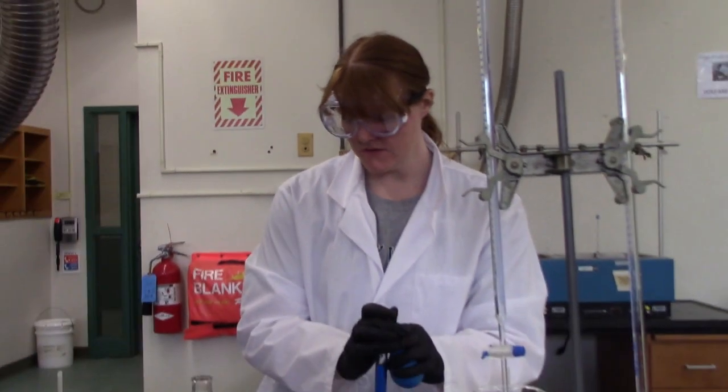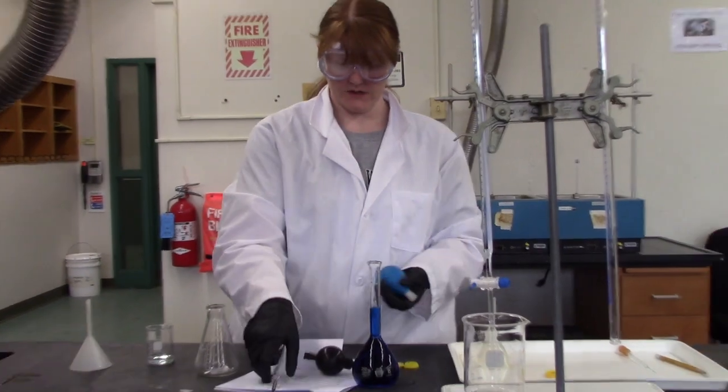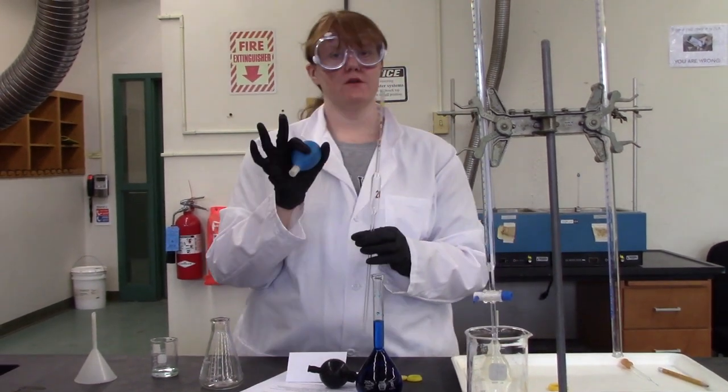I can pipette out of this, although sometimes it can draw a vacuum if the flask is smaller, so sometimes I choose not to. I'll just pour it into another container then. This pipette is much thinner than the neck here, so it should be okay. I'll show you how to use both bulbs.